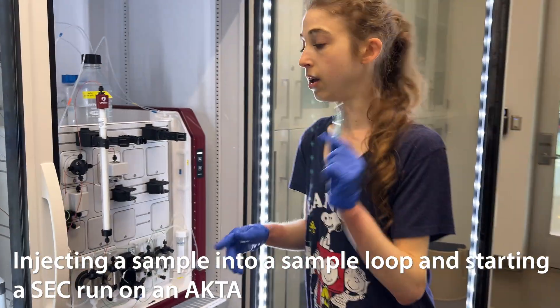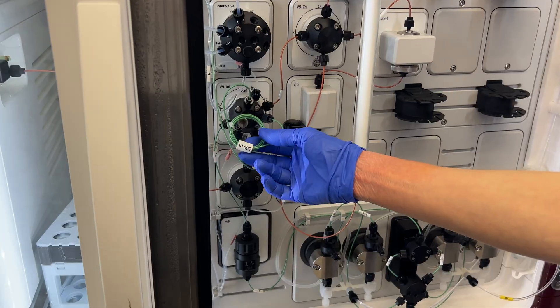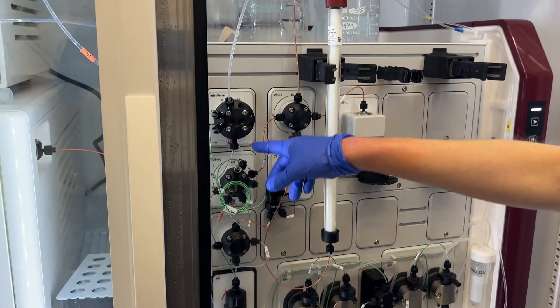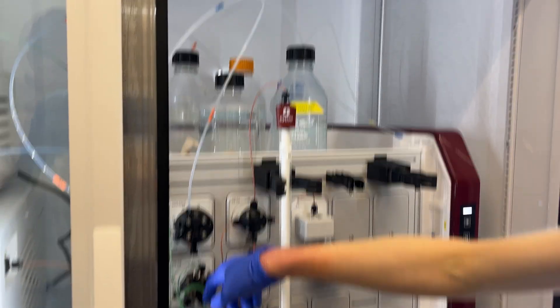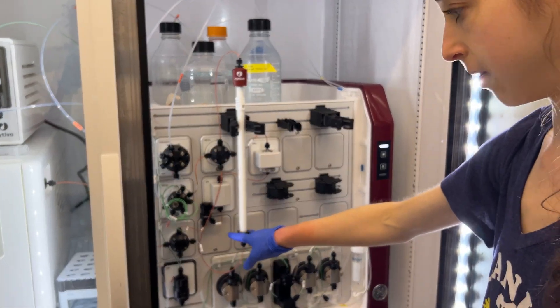We are going to inject our sample of protein into this valve to store it in this sample loop before we tell this machine to go and direct the liquid onto the column for our size exclusion chromatography run.